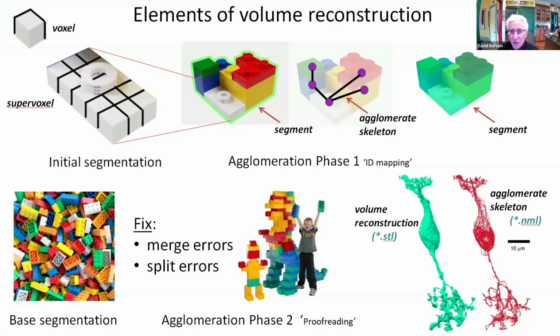And so here's an example of a volume reconstruction from this new U volume using segmentation based on ground truth that I produced in the volume, handed to Scalable Minds, which they then used to generate a model to do the segmentation. Now, the point you have to understand here is that Scalable Minds will do this stage of agglomeration for you. They actually give you the opportunity to choose how aggressive to be with this when you're starting with a new data set. And so what you're trying to do is find the right balance of merge and split errors given the relative difficulty of fixing these two so that you're as efficient as you can possibly be. So you have the choice. You can decide whether you want to split them all the way down to the initial supervoxel size or close to having almost everything merged into a single segment.